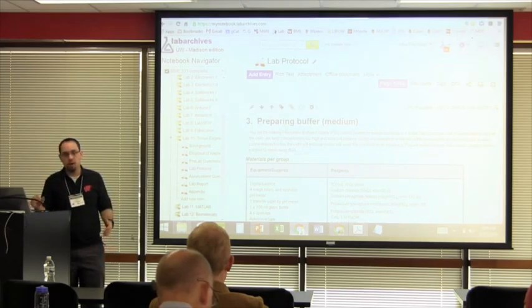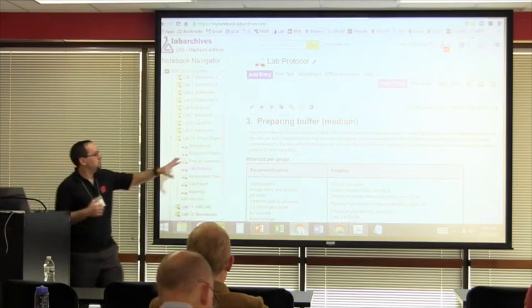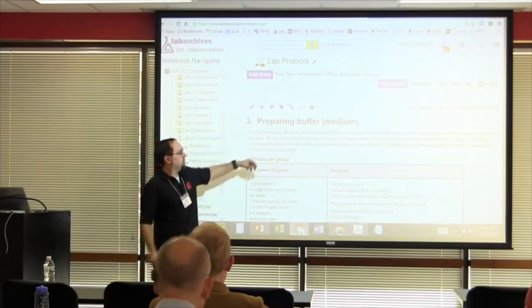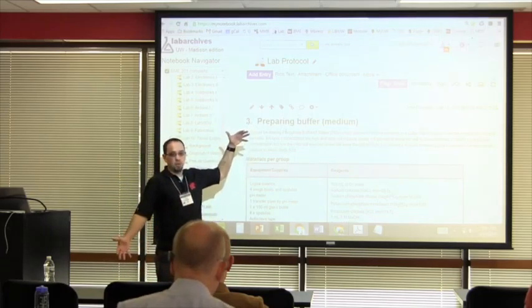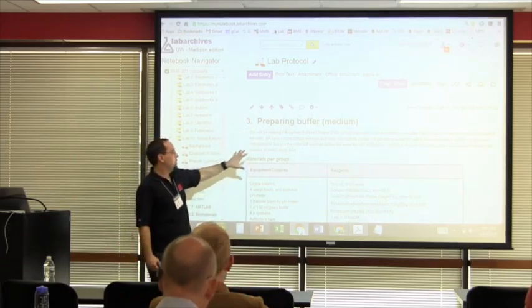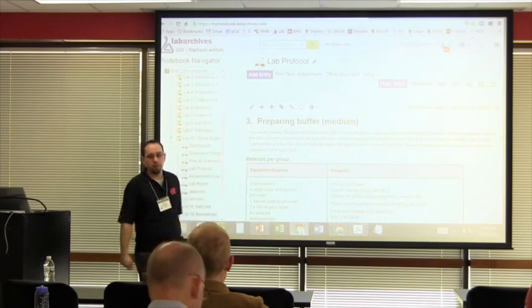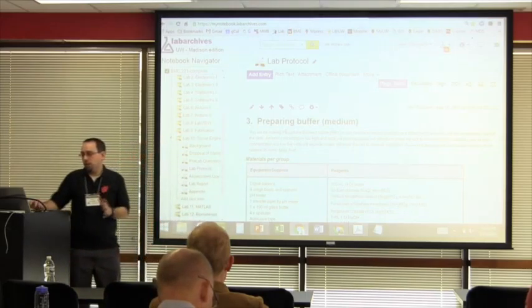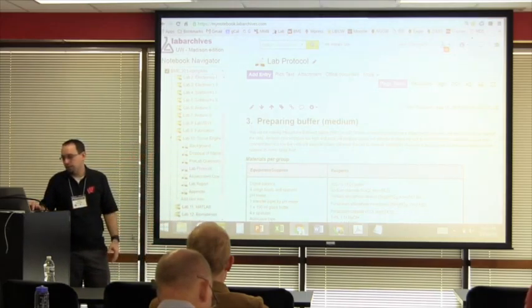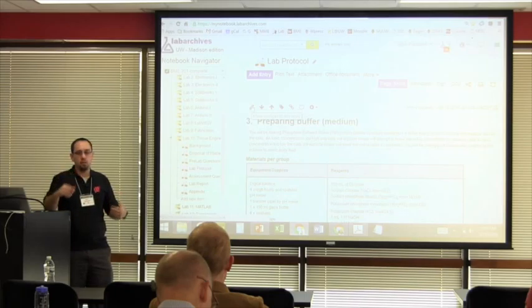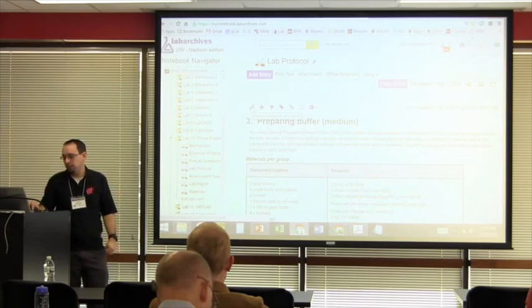So if the students want to, we could print off just this one page for them. We could print off the whole entire — I suppose this one entry — we could print off the entire page for them. Or they can edit just one of the entries and not the whole page. It really depends on how you want to set things up.